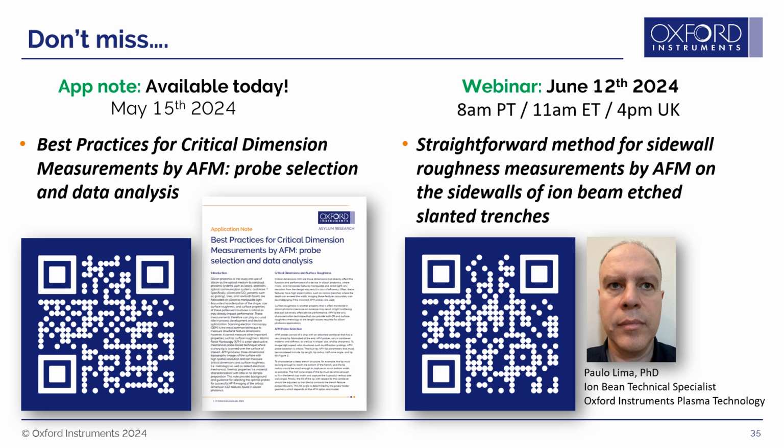So if you're trying to measure the sidewall angle, and the sidewall angle is gradual enough that you can accurately measure it with the probe, then it'll be better to measure it with whatever sides of the tip are symmetric. In some cases that will be just side to side with the 90-degree angle scanning. But again, for the tilt compensated probes, you'll be able to scan 0 degrees from front to back. So that's the point of that discussion: you have to think about the individual probe that you're using and how that compares to your sample features.